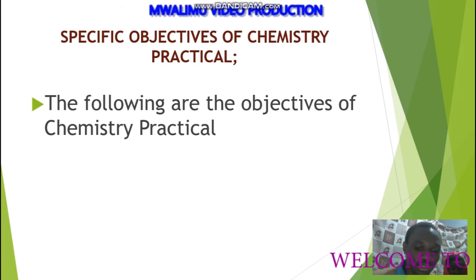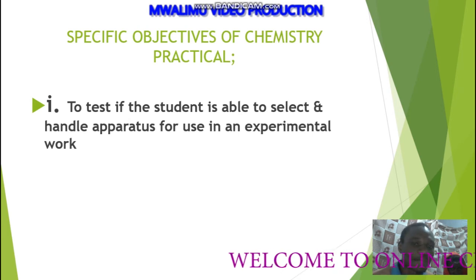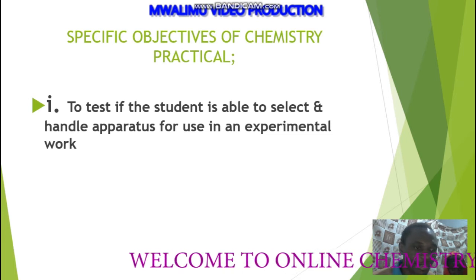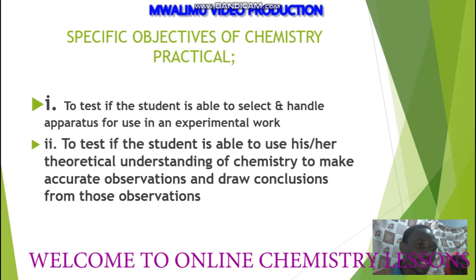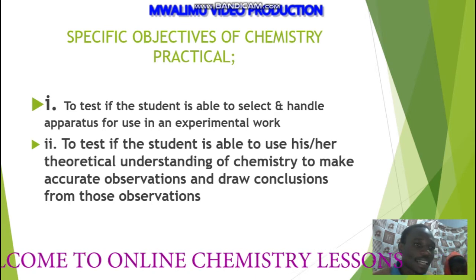The specific objectives of chemistry practical are to test if we as students are able to select and handle apparatus for use in an experimental work.